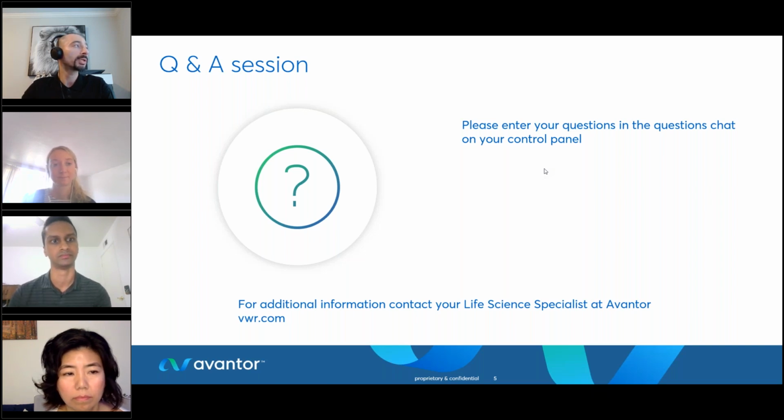And would you be able to sequence a mixture of 600 base pair amplicons and a 10 kb plasmid in the same run, for example? Yeah, this is definitely possible. For ease of downstream analysis, you may want to prepare significantly different size libraries with different barcodes, for ease of demultiplexing, and so you can provide each barcode folder as input for the workflow separately.